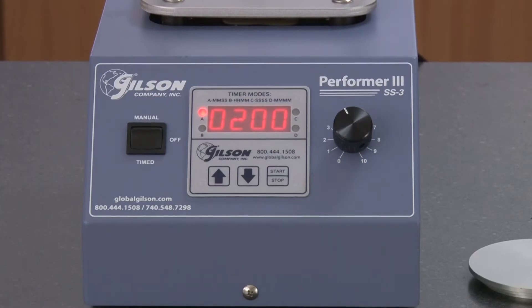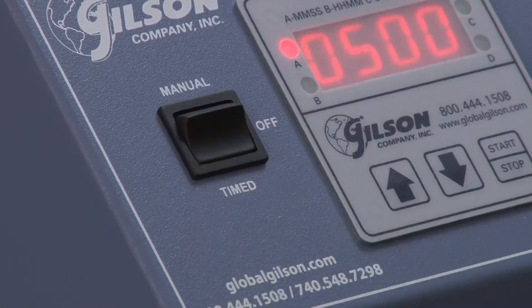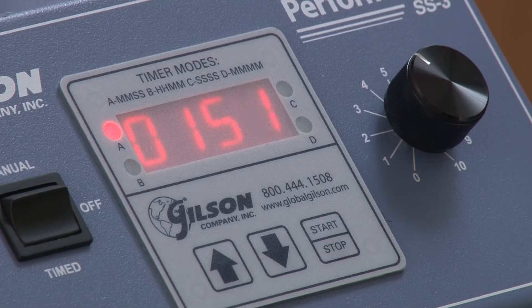Users have total test control including vibration amplitude and whether the test duration will be manually controlled or pre-programmed. The digital timer features a large LED display and a mid-cycle pause function.